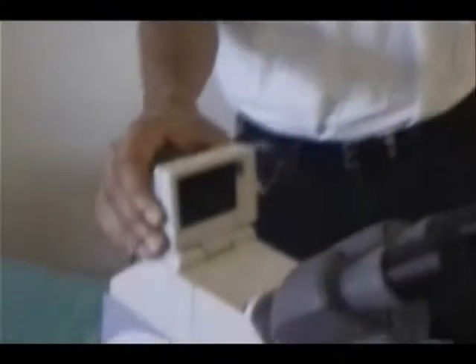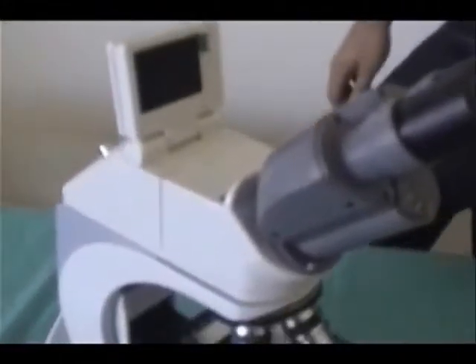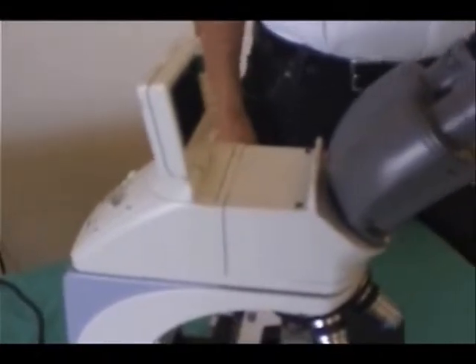Hello. Today I'm going to show you this binocular compound microscope. This is a model M82 e-LCD and this features a high resolution LCD monitor. Now this microscope, it has a simple design yet it has advanced features.